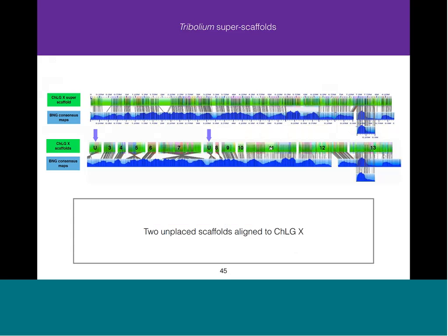This, for example, looks like maybe a translucent box, but it's actually just a light yellow contig. So for Tribolium and for a lot of organisms, I see the gaps in the scaffolds are actually so small that they don't throw off the sequence assembly, or the CMAP assembly. XMAP alignment, there we go.